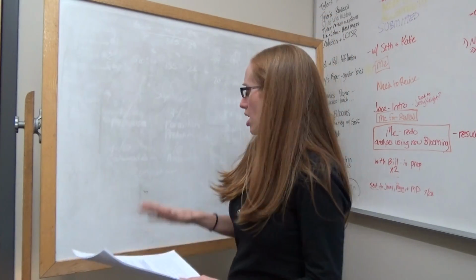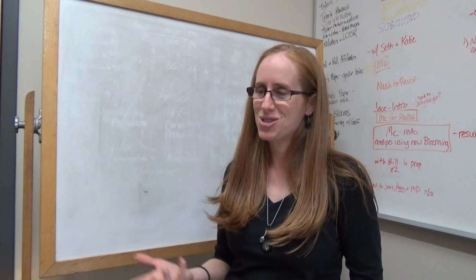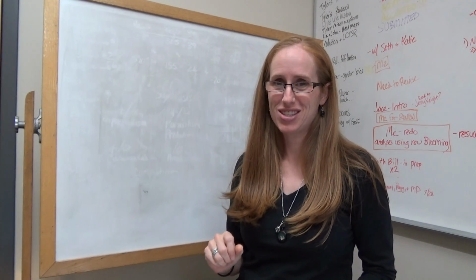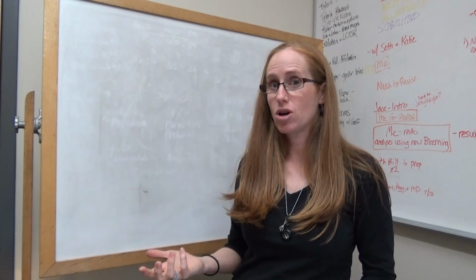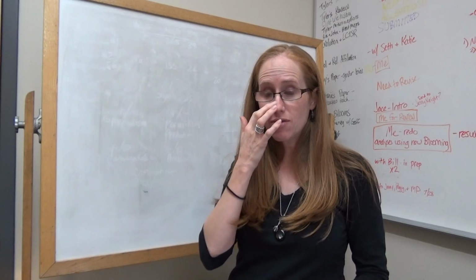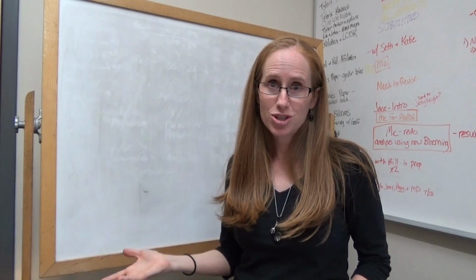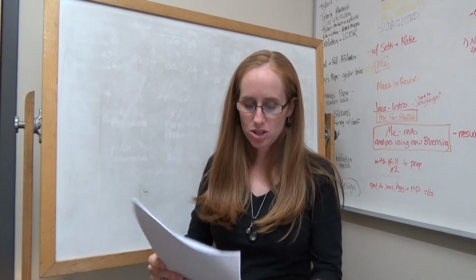Alright, so for this lab, they're going to use their fruit fly populations to be a model of population growth. And actually, their populations that they've grown in the lab, they will do exponential growth, and they will do logistic growth, and then they will crash. So we're going to use parts of it to do each thing.